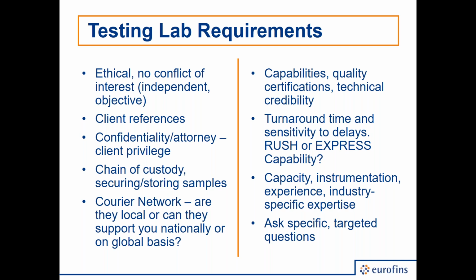A lot of times the most important thing is, hey, do you have a courier network who can drive 3 hours into the sticks and pick up my samples on Tuesdays and Thursdays, because I don't want to rely on FedEx or UPS, or I don't want to have to put one of my people into a vehicle and drive them all the way. Many of the larger and more reputable laboratory networks do have very robust, dedicated courier services that can pick up samples same day. In many cases, they'll go 5 to 6 hours out from their lab, and they're able to provide coverage all over the continental United States and North America.